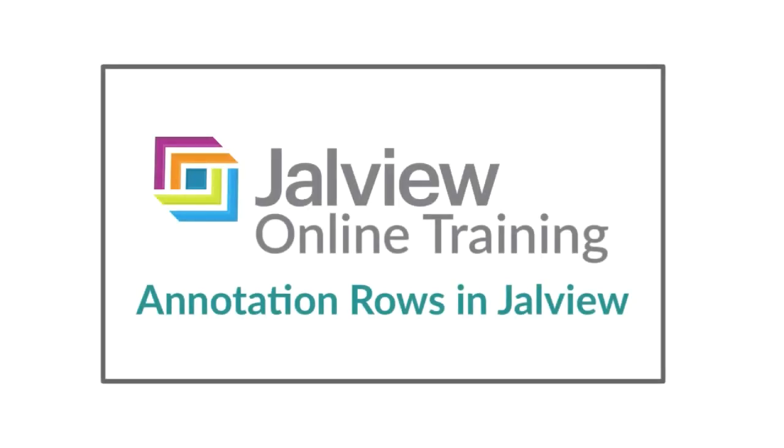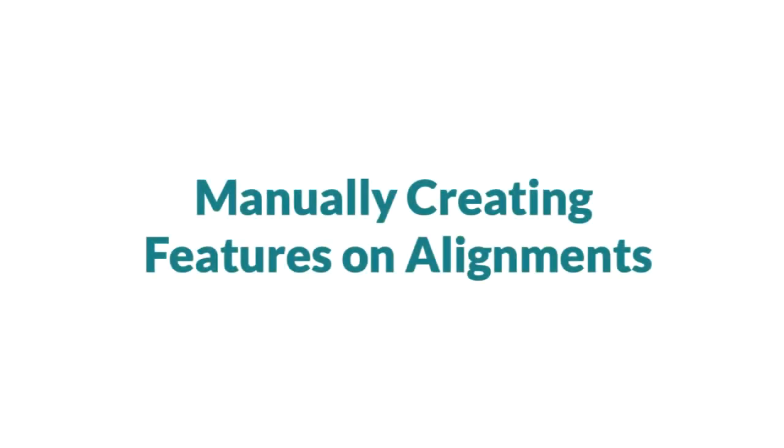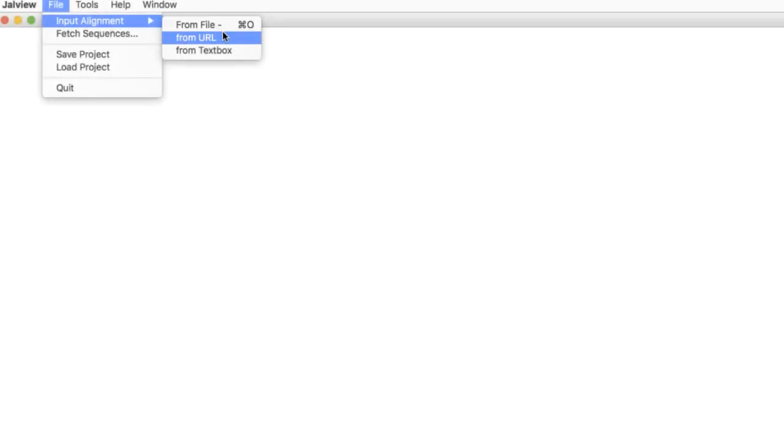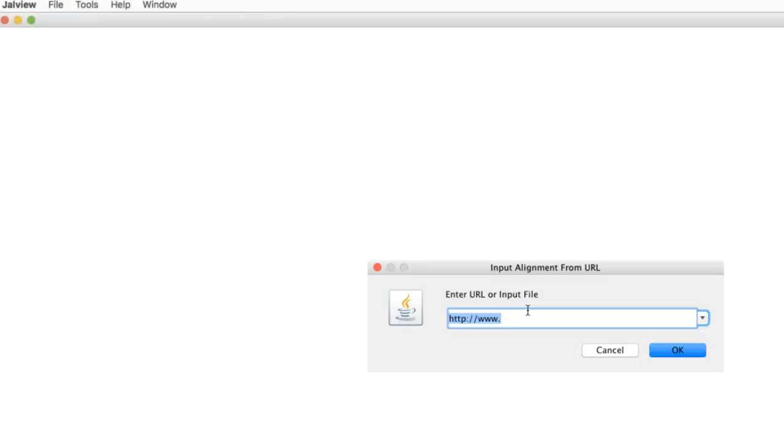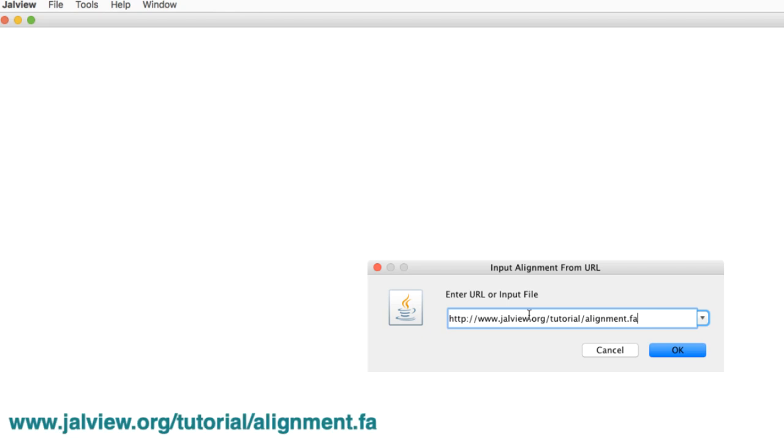We have another video that discusses annotations. The link is in the text below. I will demonstrate how to manually create sequence features on the alignment. First, I will import a group of sequences that have already been aligned. The URL is shown on the screen and is in the notes below.